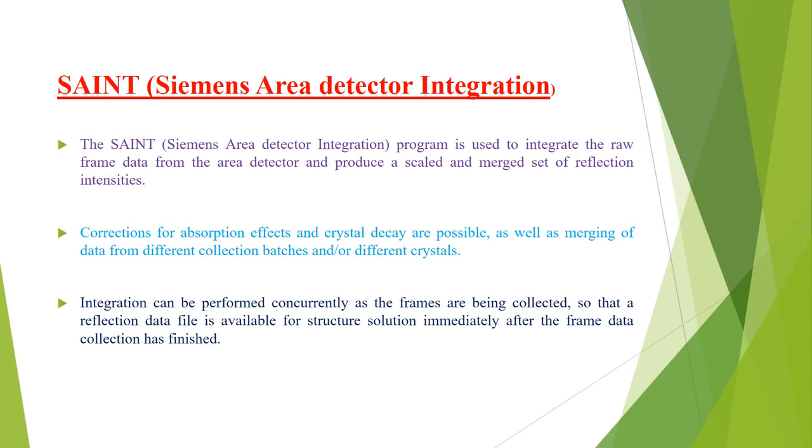After operating the XRD instrument, which provides the different kinds of scattering and diffraction patterns, these different kinds of software are used to obtain the real crystal image from that single crystal.